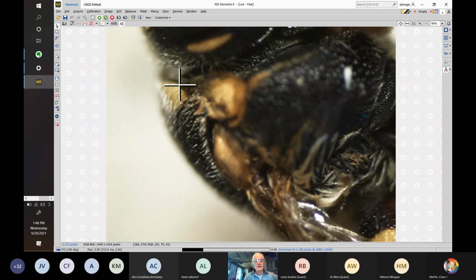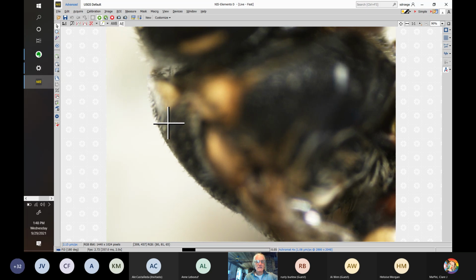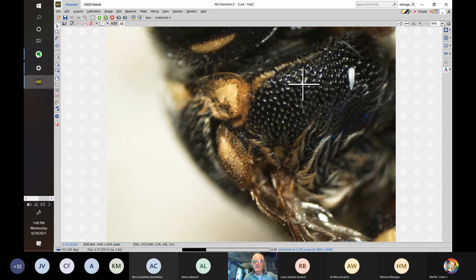Okay. Oh, I see. This is the cliff-like part of the scutum, which we'll just change slightly here. And down below, way down below, is the pronotal collar that is going from here to there. And this big section here to here, that's just not present maybe in any other genera within the group and species of bees in general. So that's a good character. But so this is a rich in character genus. So again, there's a sharp line.